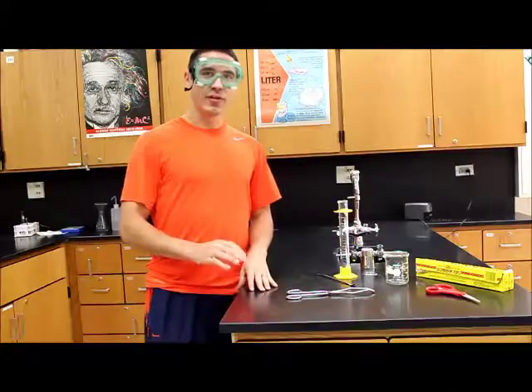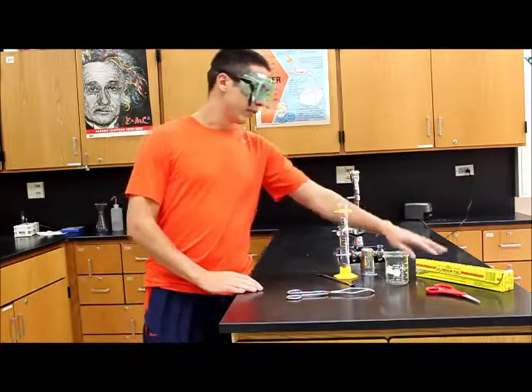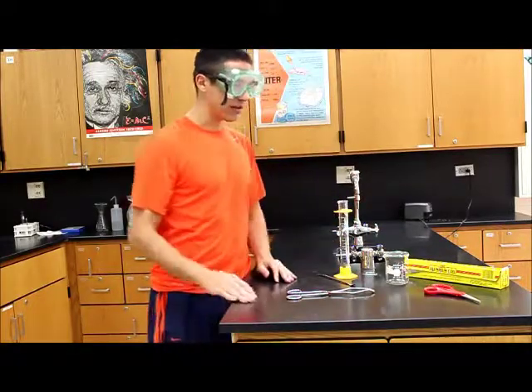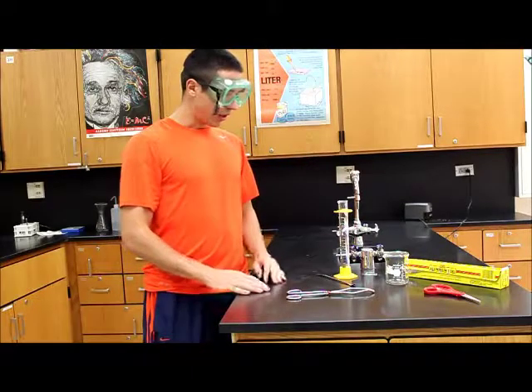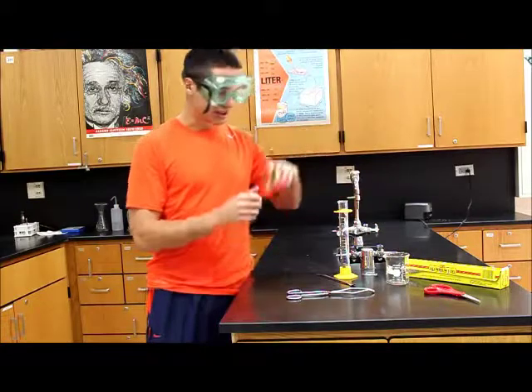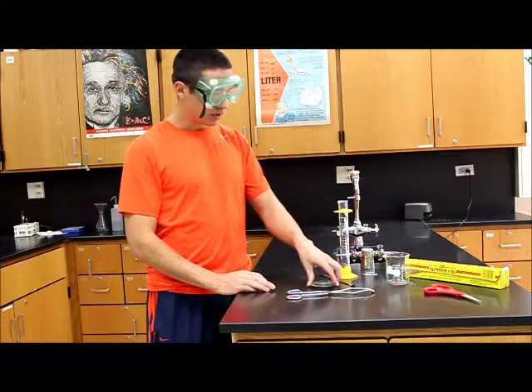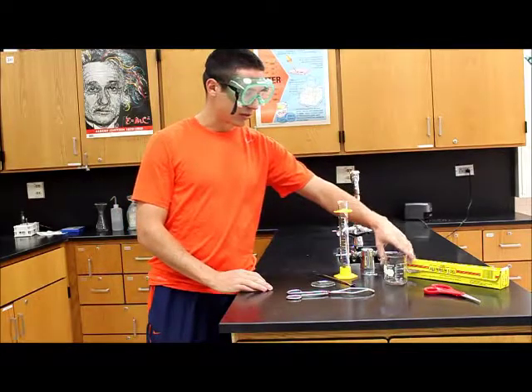So let's go over and take a look at a few of the materials you're going to use in the lab itself. So over here we have all the materials you're going to need for the aluminum copper(II) chloride lab. We have the aluminum foil that you're going to need. And to cut the aluminum foil you're going to use just a pair of scissors. Then we have a watch glass. We can use the watch glass as both our weigh boat for the copper(II) chloride and also to cover our beaker with.